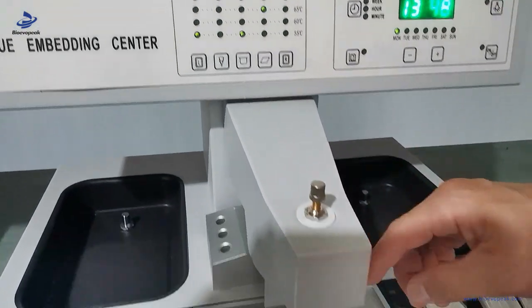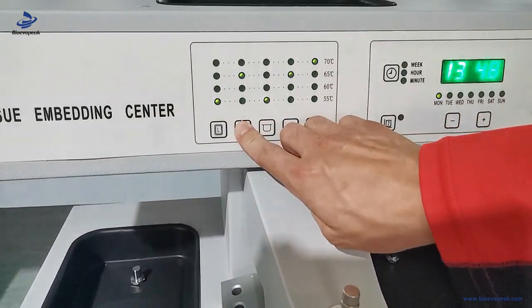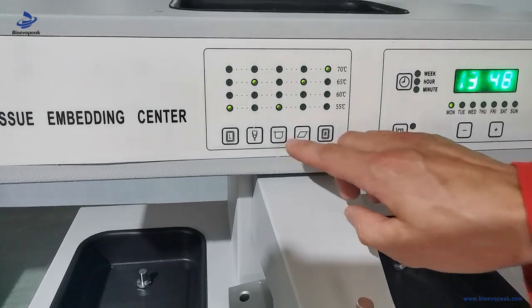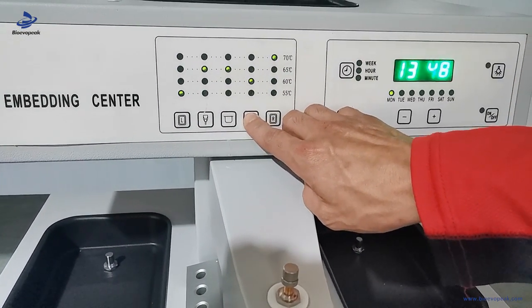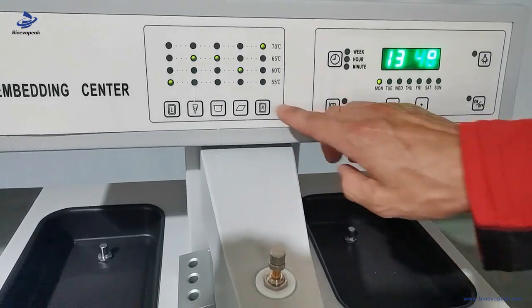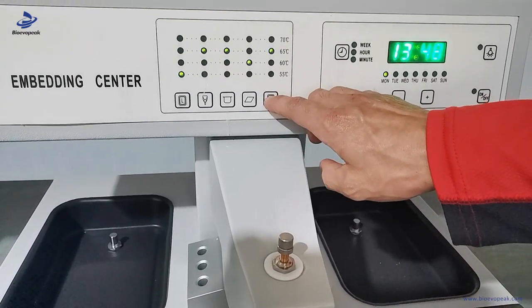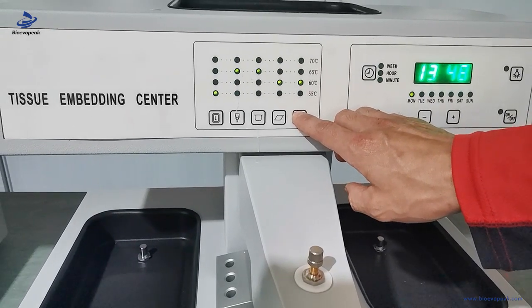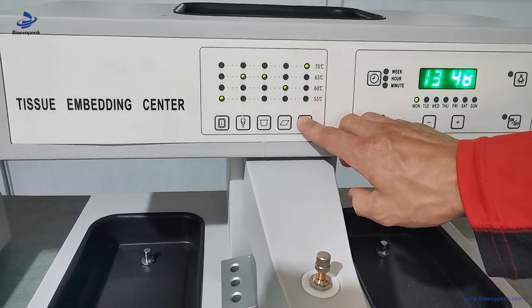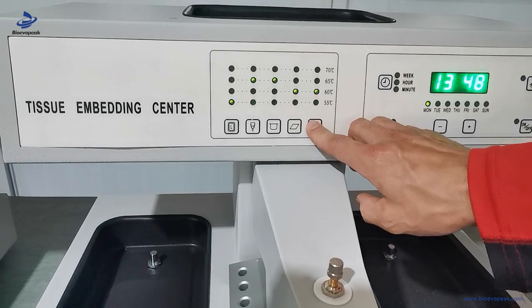For the paraffin lotion, working table, and right heating box, we can adjust the temperature as desired. For example, 65 degrees centigrade.